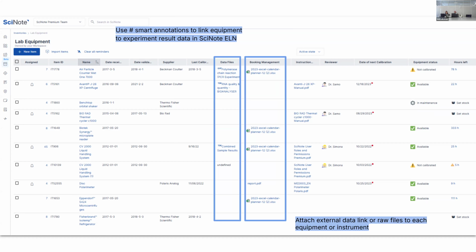What you can do is two things. So one is you can utilize our APIs. We have customers using APIs for very different things. For example, and this goes to the previous point actually, they have RFID tags on specific equipment, and when a certain equipment leaves the room, they can find it, and this is updated in real time in SciNote, so they know in which room a specific item, sorry, that is equipment, currently is. So they can then find it and take it back to where it's supposed to be.